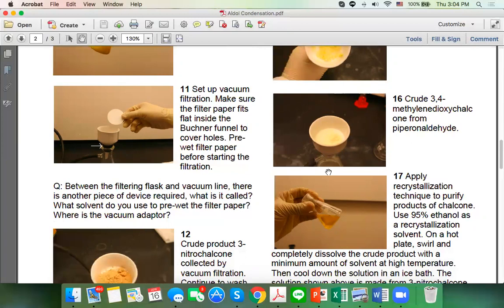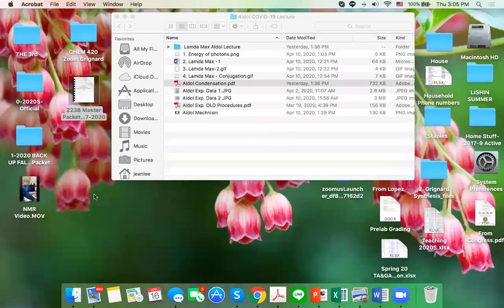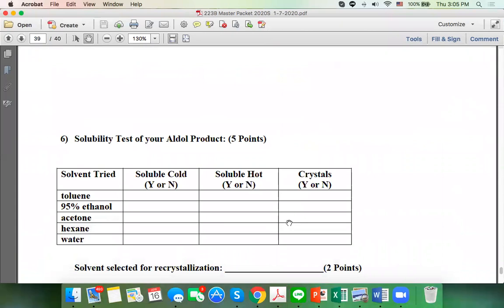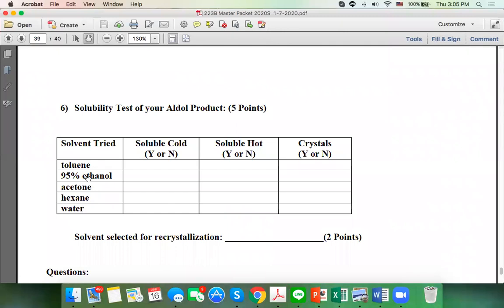Then you recrystallize it using 95% ethanol. Now tell me, ladies and gentlemen, can someone offer me procedure? No. Wait a minute, because we are supposed to run a solubility test without telling you 95% is what we recommend to students. Can someone tell me? What are you supposed to choose right here? If we give you solvent type 5, solvent type, in order for you to determine what is a good solvent for recrystallization. All right, tell me who can offer some tip here. How do you choose the right solvent for recrystallization? I give you one minute, okay?